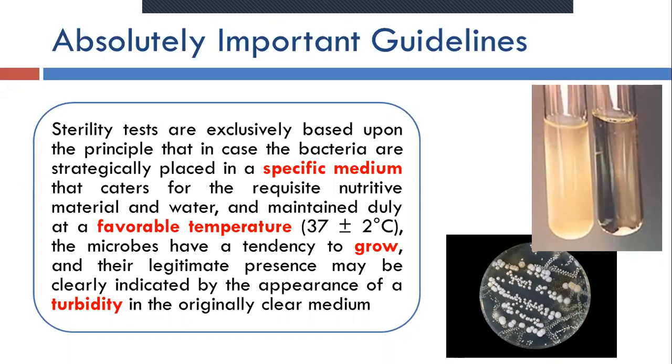A very simple principle, as I told you earlier. If your product is contaminated with any live microorganisms, and you put that product in a specific medium at a favorable temperature and incubate it, these organisms will definitely grow, and that growth will be evident by the presence of turbidity.